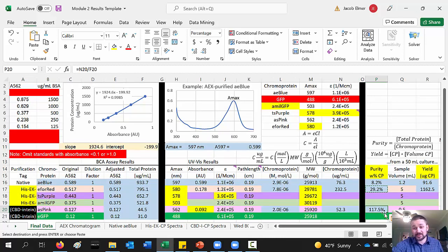So that's probably what you're looking at here, is that this measurement is inaccurate. If that protein was more concentrated, we get a more reliable value, okay? So yeah, I would hope that it was 100%. Here I see that it's over 100%, probably because this is not accurate, okay? But that's great. I mean, greater than 100% purity, we know we don't have impurities at least.